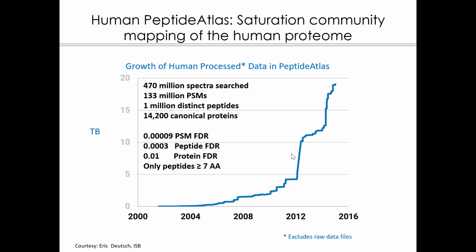Now there are several of these repositories, and probably the most widely used is Pride, and also Mike MacCoss has one, a very large one, Panorama. These are extremely useful resources because there are millions of dollars worth of data that have been collected in some context and are available for scientists to re-explore.